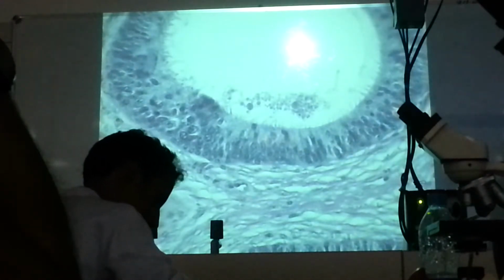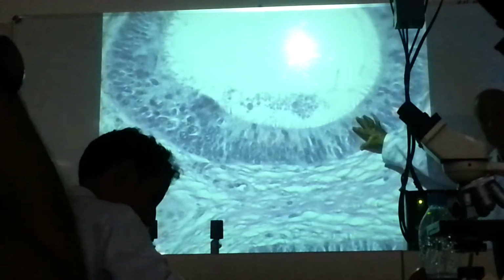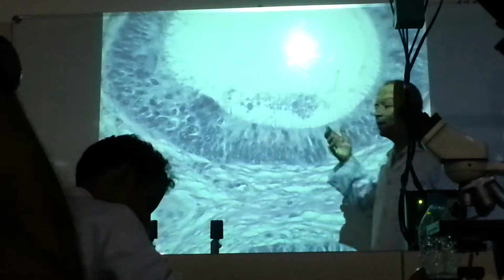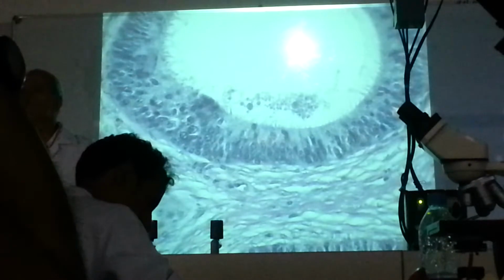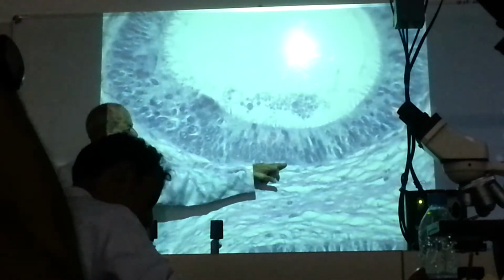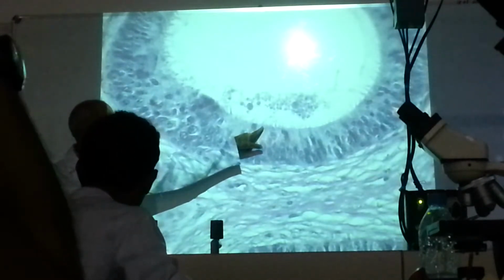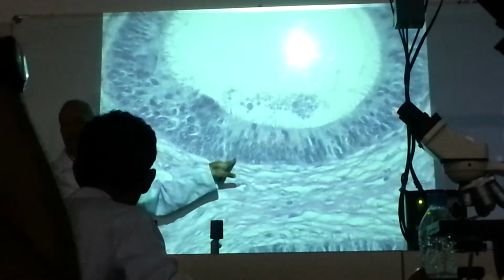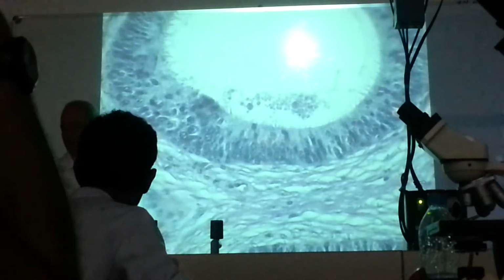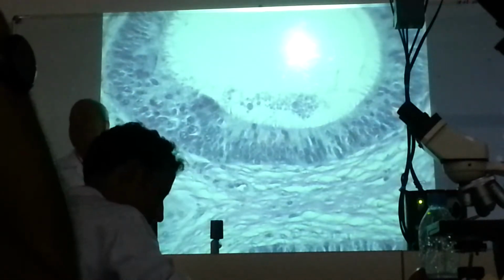Okay? Can you repeat it again? What is the type of section? Epithelium. It is pseudostratified columnar with stereocilia. What do you mean by pseudostratified columnar? All the cells rest on the basement membrane or basal lamina, but some of them reach the surface and the others stay basal, because the basal cells renew the other types of cells. What is present on the surface is stereocilia.